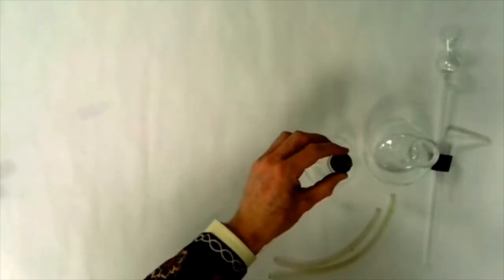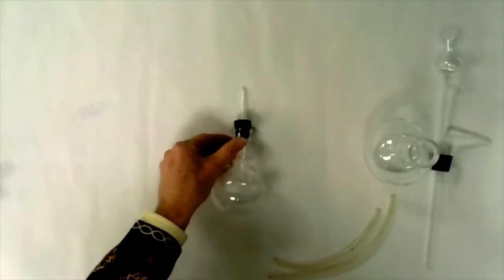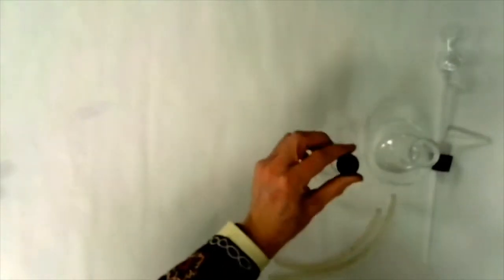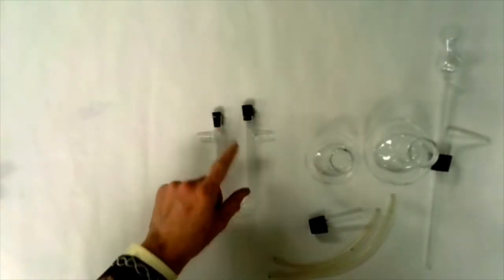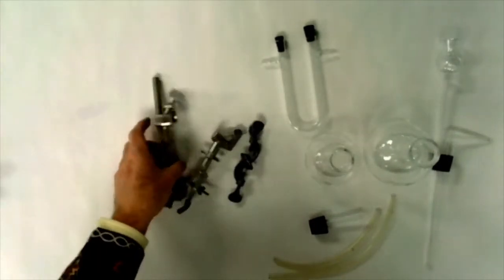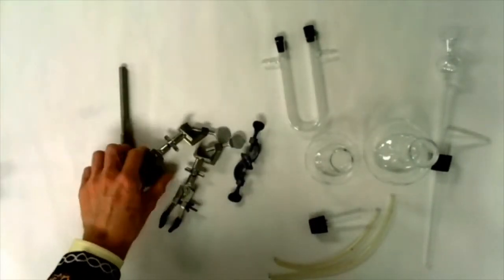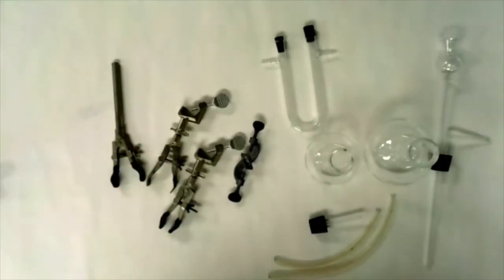A stopper that fits the small Florence flask. A drying tube. We're going to use a U-tube that has two stoppers in it and several clamps to hold everything securely.